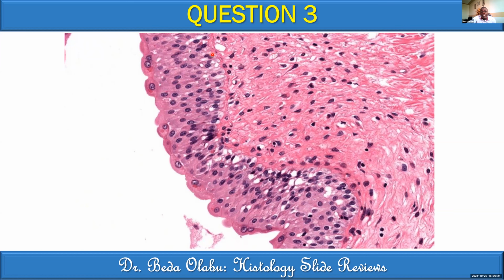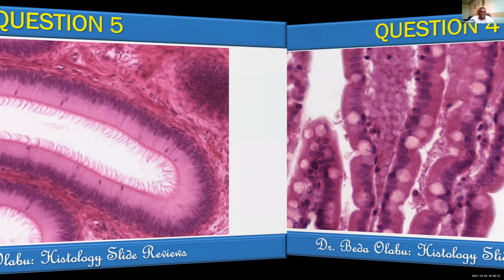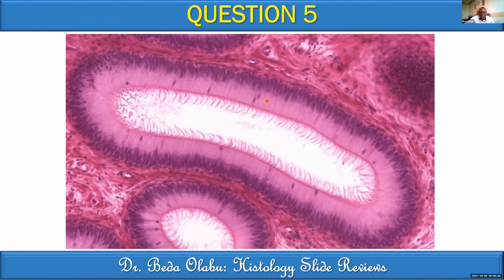So this is definitely stratified, and Doc had identified the stratified cuboidal, and we clarified that we don't just have to call it stratified cuboidal because of the other things we've seen. Let's call it transitional epithelium. If you are to have an actual pseudostratified, and number 5 is an actual pseudostratified, again, we divide it into zones, and we see that the apical zone, in this case, is relatively devoid of the nuclear layers.